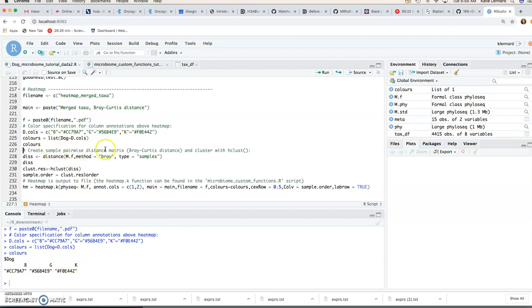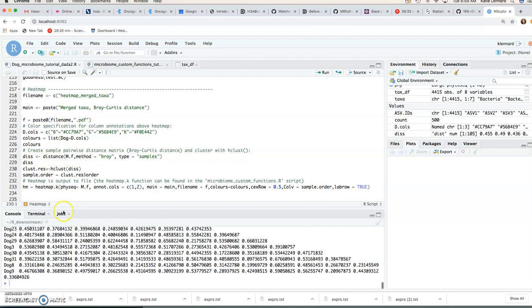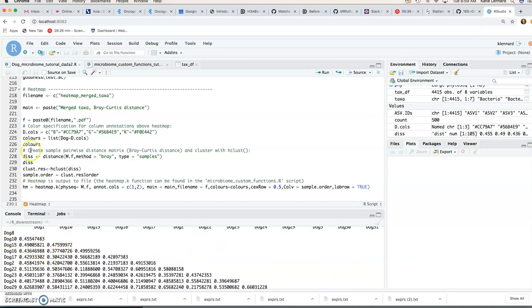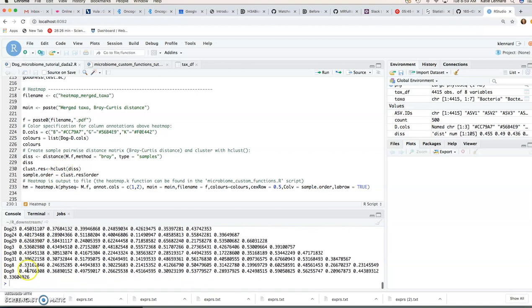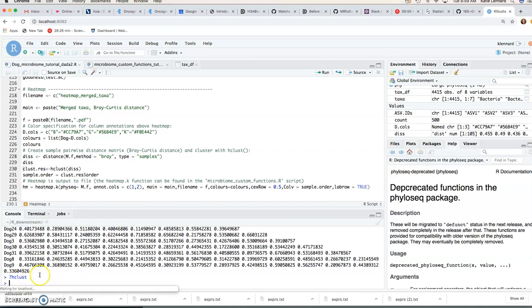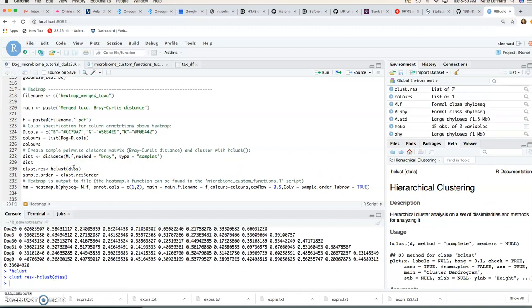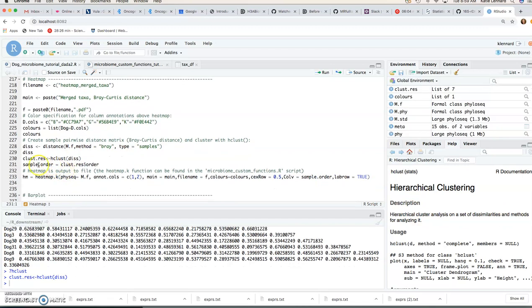So then we want to create a pairwise distance matrix with Bray-Curtis distance and we can use the distance function for that from the phyloseq package. So that'll give you that pairwise matrix and then we're going to pass this distance matrix onto the hclust function. So that will actually do your hierarchical clustering and give you your sample order.